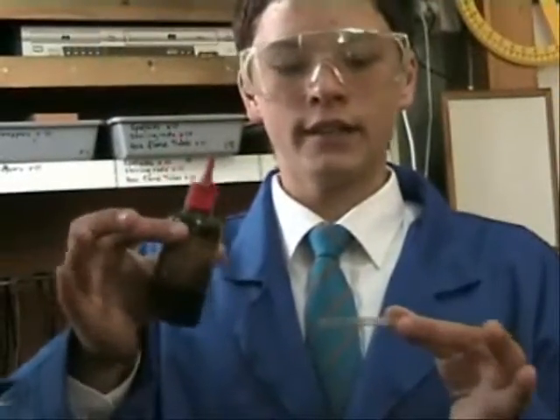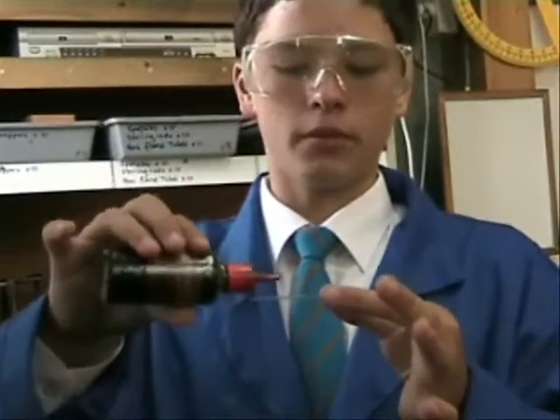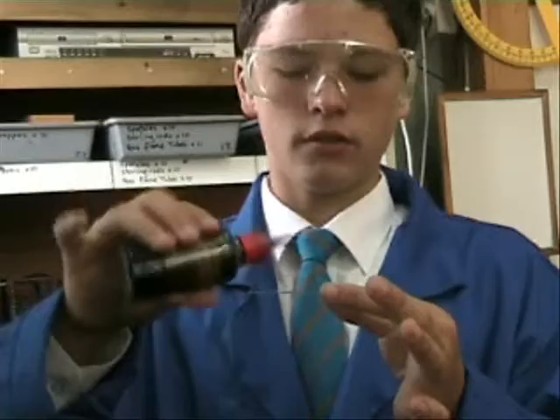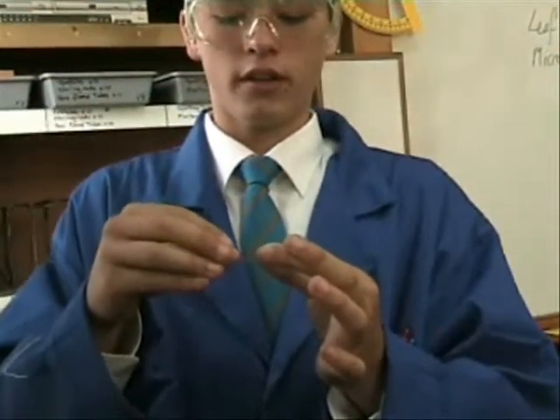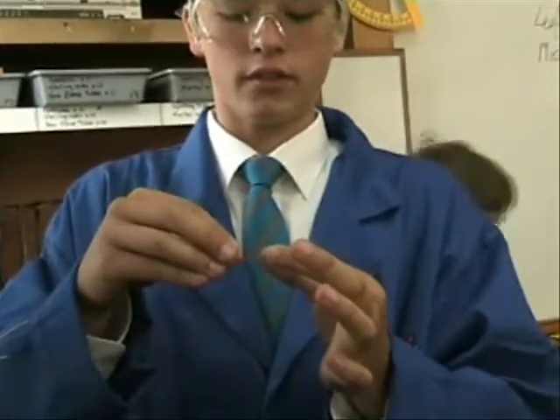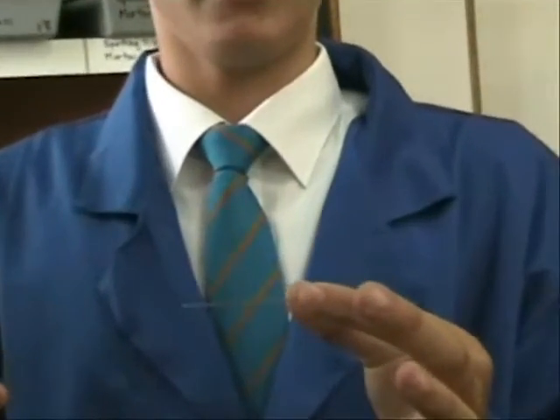Take your cover slip and slowly press it over the leaf. And there you have it.